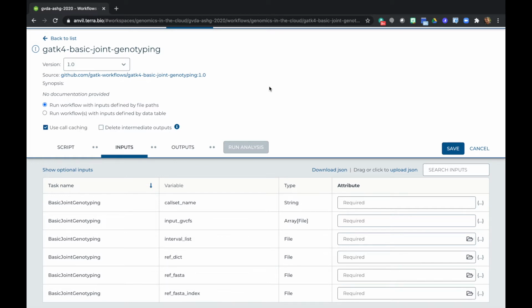If they're doing things right, they should be providing example data and resource files that allow you to reproduce their own test case. And by the way, this also helps you figure out what should go into each of these if you have no idea what some of these words even mean. Okay? It's okay to be new and it's okay to be learning. That's why we're all here, in spirit, if not in person.